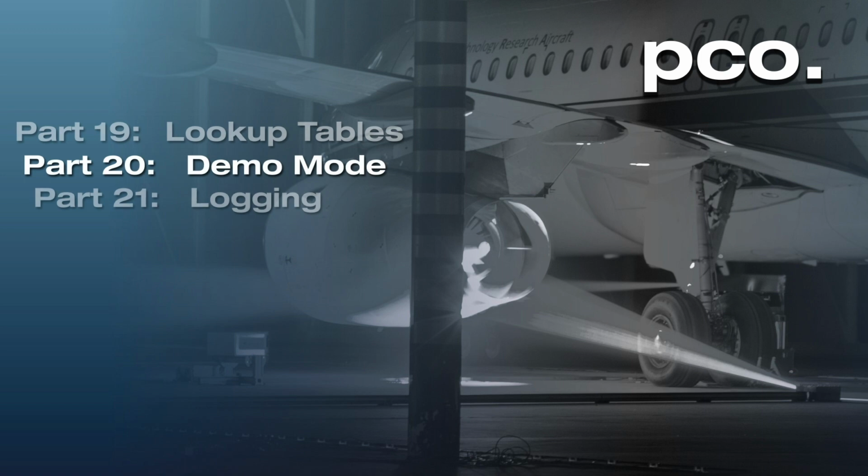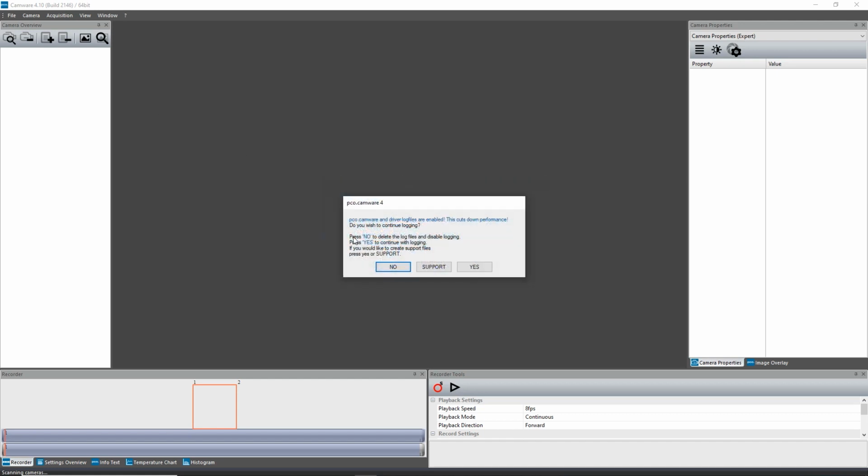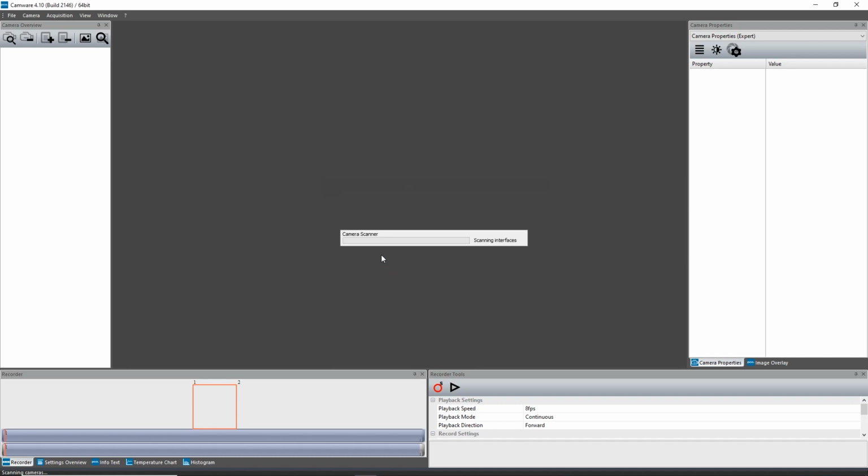Tutorial number 20, Demo Mode. Hello, and welcome to the pco.camware video tutorials. This video explains the demo mode.